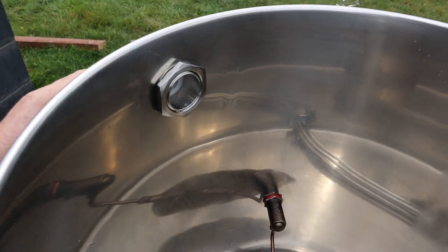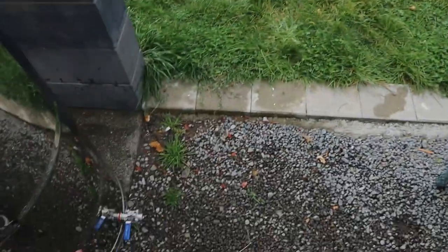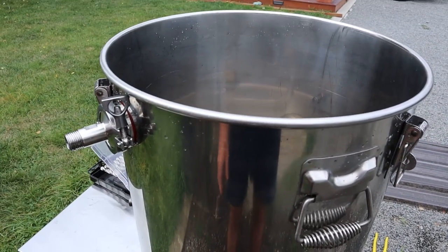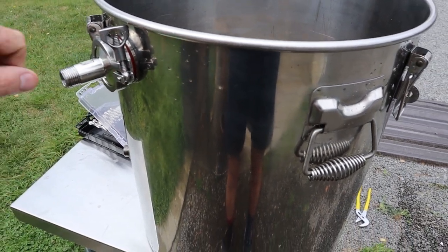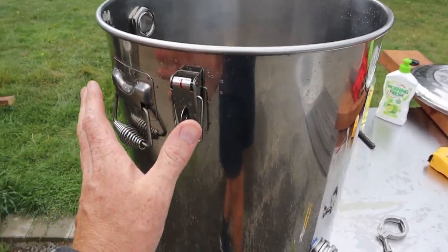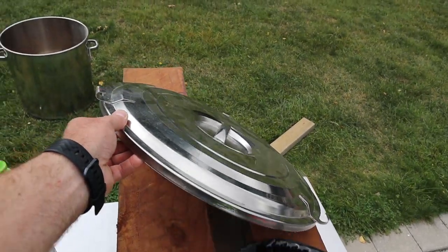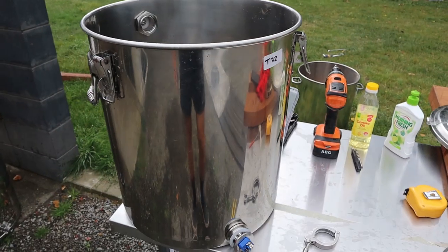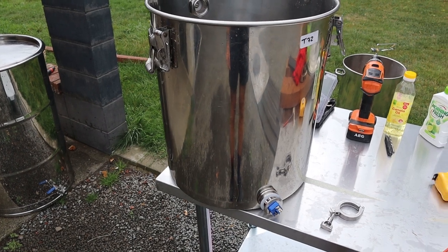Up the top I've got another tri-clamp with a hole drilled in it and a piece added there. That's going to have a tap on the outside so you can put the lid on, turn the element on with a PID controller, and open that valve — and it will just start hammering steam out. I'm going to insulate all of this. The lid actually comes already insulated with a few clamp-downs on it, so it's pretty good already.